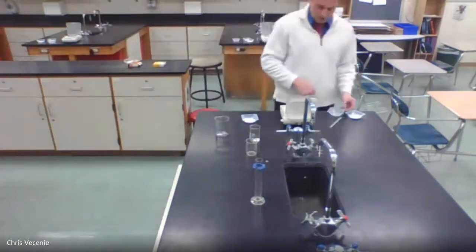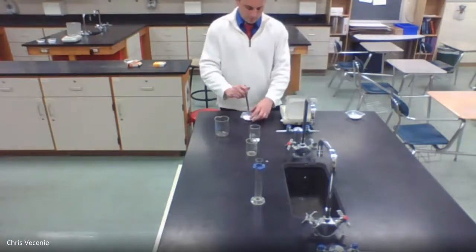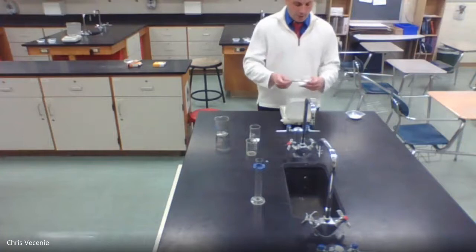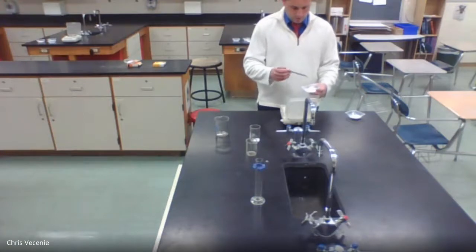Then we're going to take another dish, put it up here, zero it out, and we're going to get 0.75 grams of our calcium carbonate. Okay, overshot just a bit. So that's 0.68.